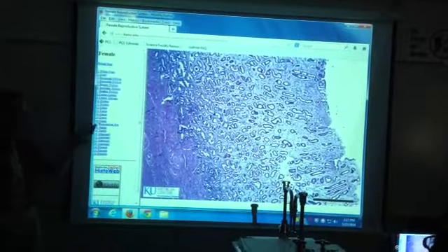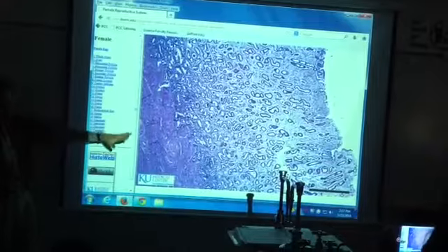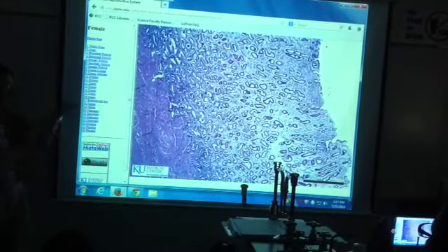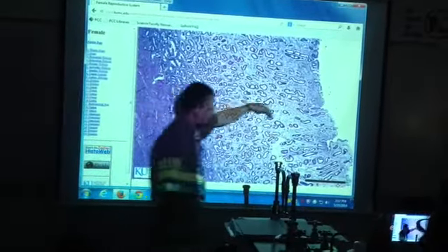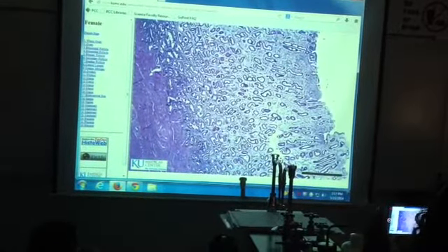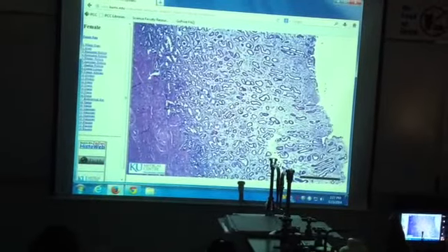They're a lot more squiggly. So this would be after you've ovulated, as you're making it thicker and more bloody. So what phase is that in uterine terms? Secretory, because you're secreting more stuff. So proliferative is before ovulation, secretory is after. That's secretory phase. The worms, we call them, are getting more crooked.